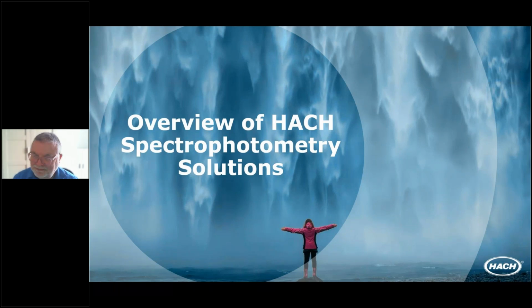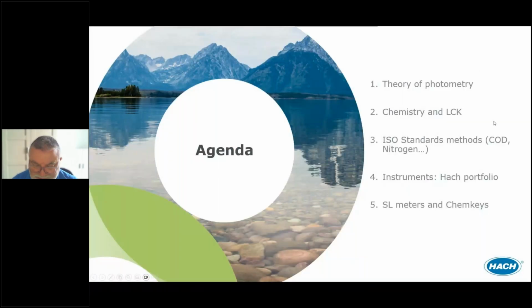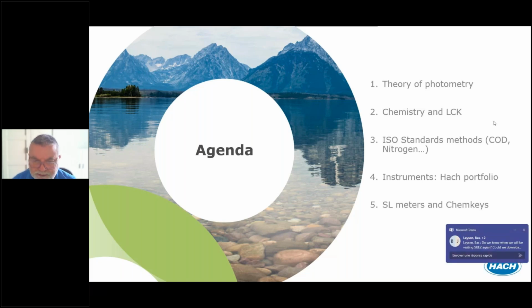Welcome. Thank you, and thank you for attending this webinar. During this hour, we will discuss colorimetric measurements, talking about the different chemistries, and in particular, LCK cuvette tests. It's better if I display the agenda. The methods that have recently been standardized, and then we will quickly review the devices that allow this type of analysis to be carried out.